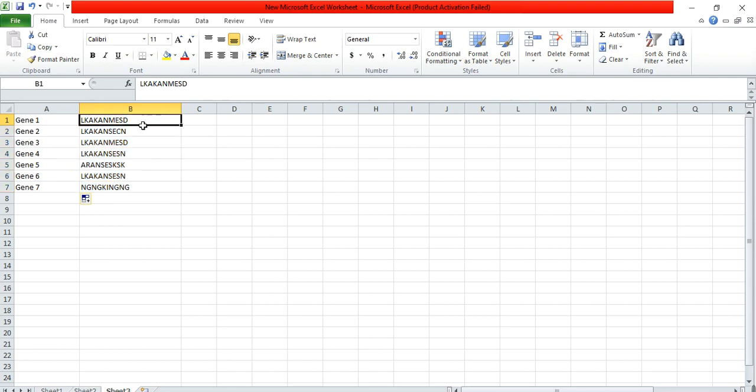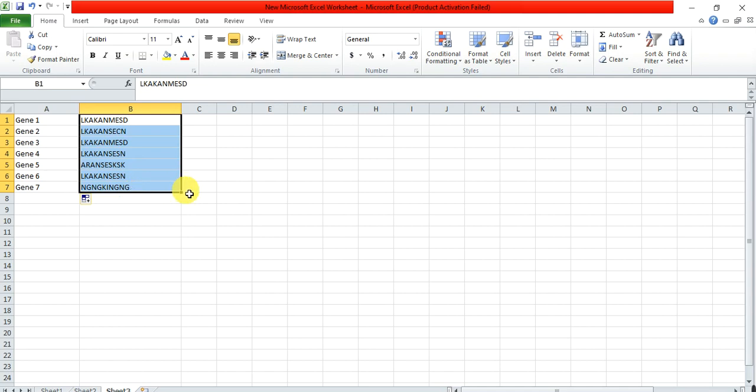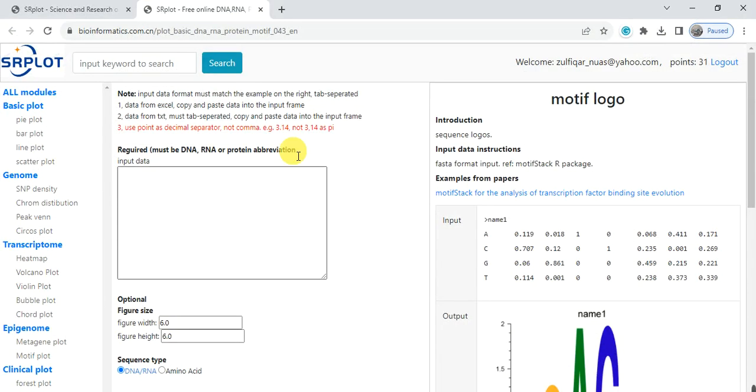These are the amino acid or protein sequences and also you can use the DNA or RNA sequences as a signature. Copy this, so we will use this link, the SR Plot.